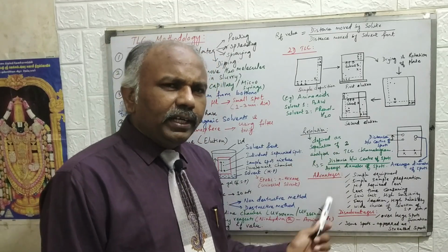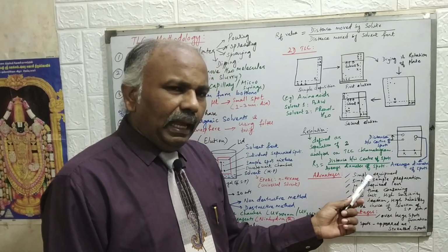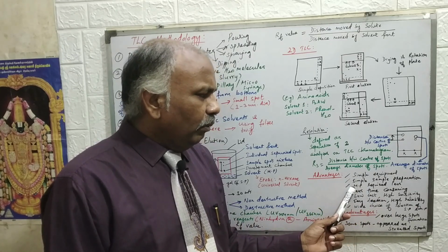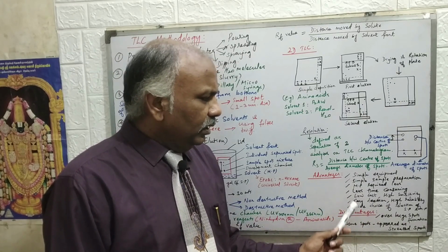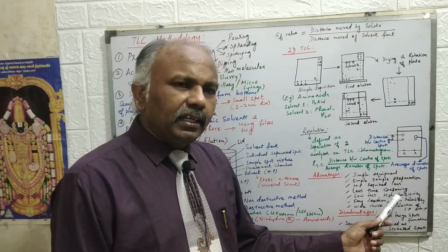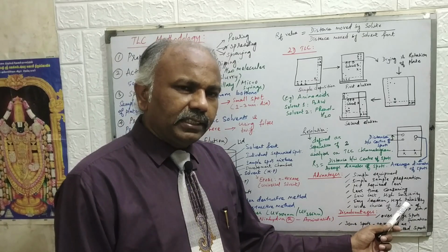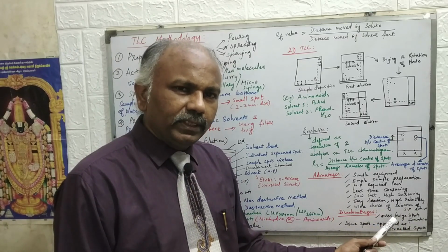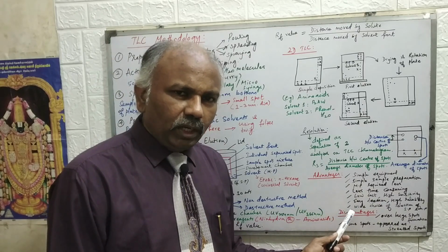Now what are the advantages of this TLC technique? It is simple equipment, simple sample preparation, and the mobile phase required is very little. It is a less time consuming method, low cost, with high sensitivity, easy detection and high reliability, and a wide choice of stationary phase as well as mobile phase. Therefore these are all very important advantages of thin layer chromatography.